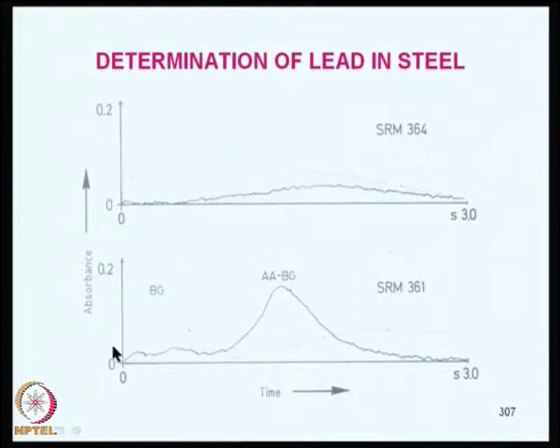So, after pretreatment, what happens? I do the integration by adding the matrix modifier. I push the pretreatment to the right. So, most of the background concomitants are already gone by the time we do the integration; this is the full 3 seconds, this is 1 second.